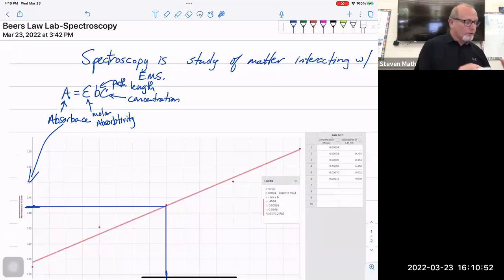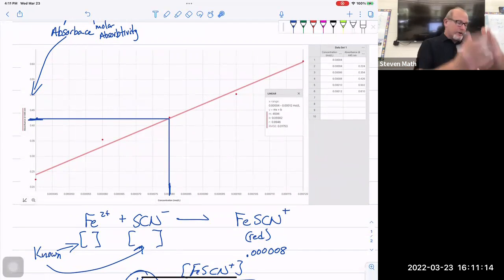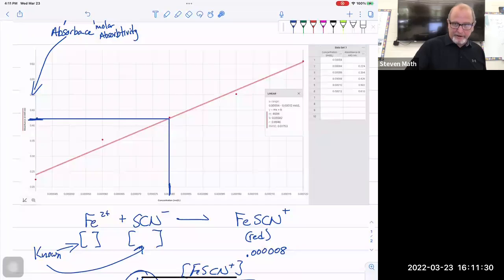You won't be asked to do any calculation with the Beer-Lambert law. They may just ask definition-y things about it: absorbance, molar absorptivity, path length, and concentration. So that's your background, and that's why it's one of the labs that's recommended. They want us to create a standard curve, and from that standard curve, make a measurement of an unknown, trace it backwards using the absorption, and get the concentration. That's the lab side of it.